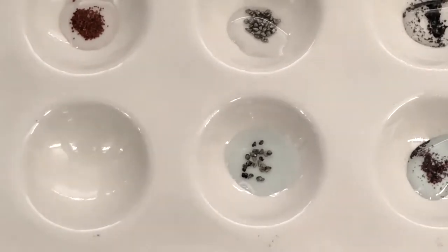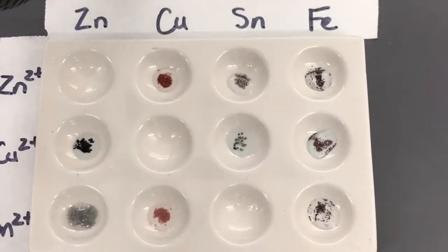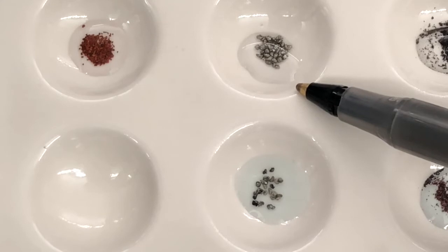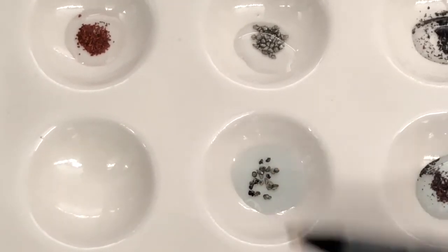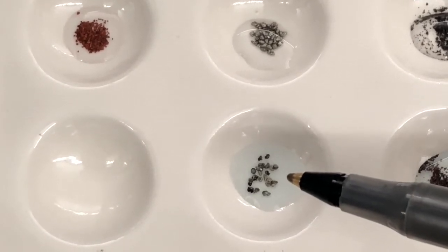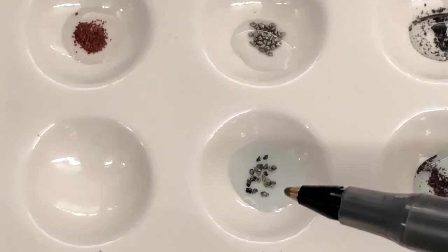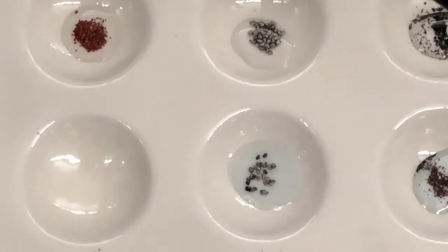While we're zoomed in, I want to go back to the copper 2 plus added to the tin. So this cell right here, copper 2 plus plus tin metal. You'll notice that compared to what we saw up here where zinc 2 plus was added to tin, now we're starting to see a darkening of some of the grains. Again, because the tin is a larger particulate, it's a bit of a slower reaction, but we do see some copper starting to turn into copper metal on the surface of the tin.